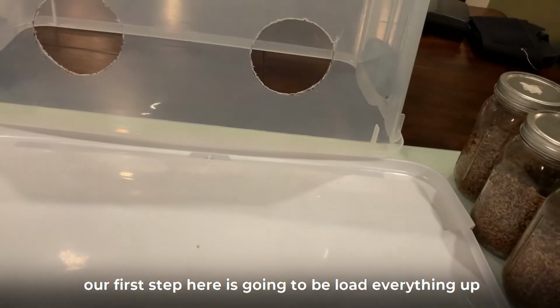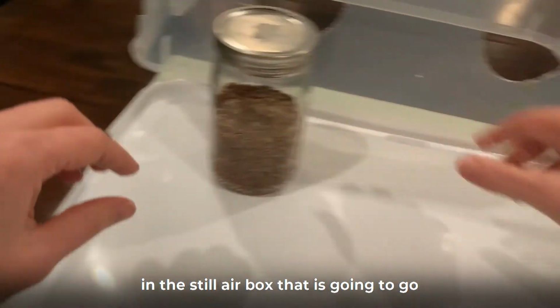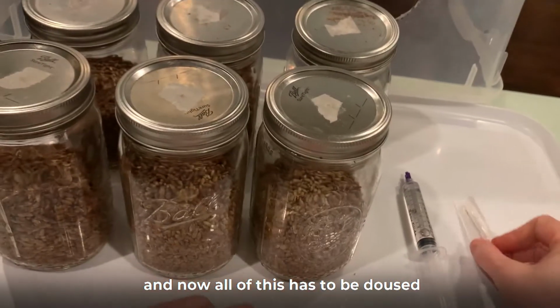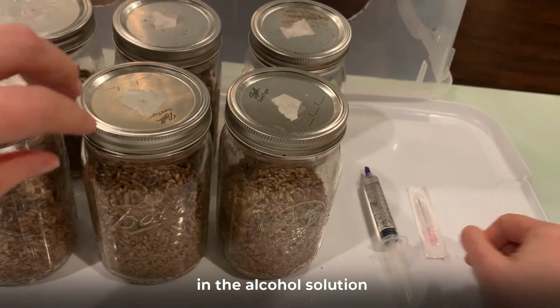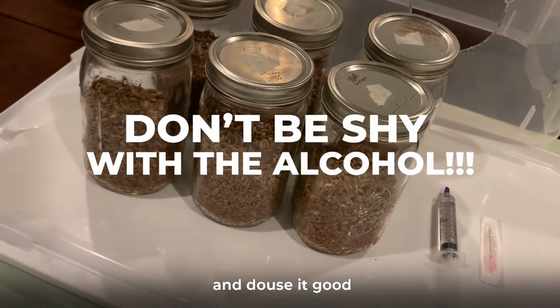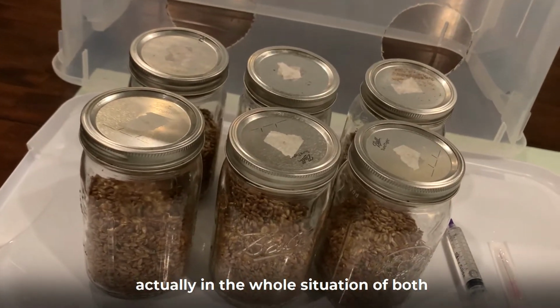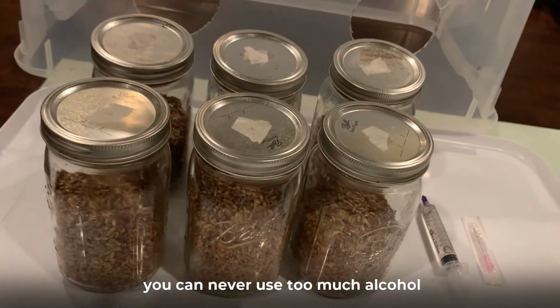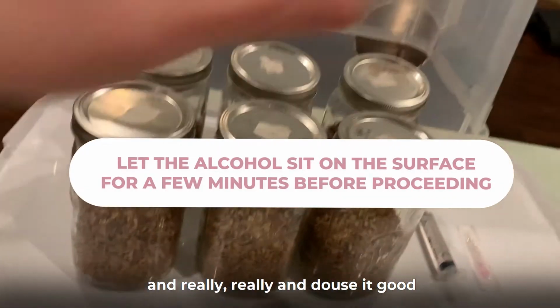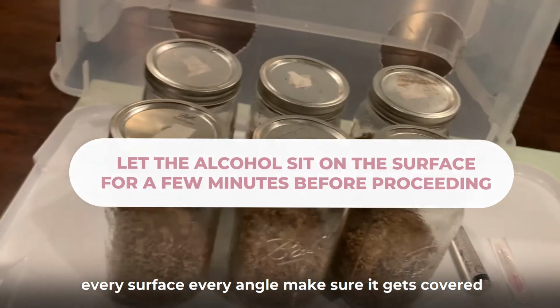Our first step here is to load everything up into the still air box. So all of the grain jars, the syringe, and the needle. And now all of this has to be doused in the alcohol solution. You have to really, really get in there and douse it good. You can never use too much alcohol in this situation. Actually, in the whole situation of mushroom cultivation, you can never use too much alcohol. Every surface, every angle, make sure it gets covered.